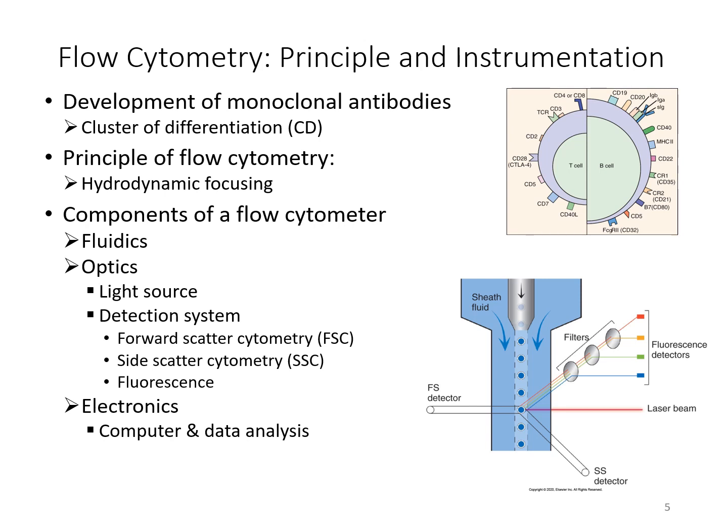So this system of nomenclature allows scientists and clinicians, laboratory practitioners, and pathologists and everyone to communicate using the same universal language for hematology, in which we can use these CD markers for diagnostic and therapeutic purposes.